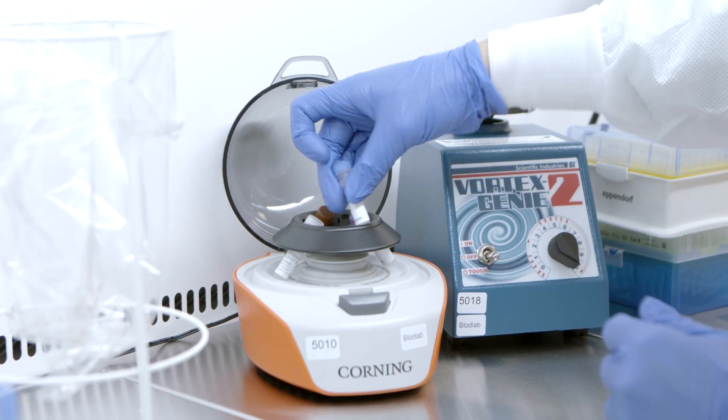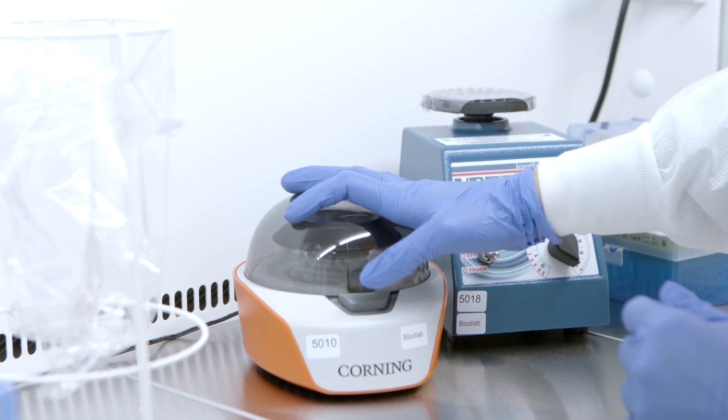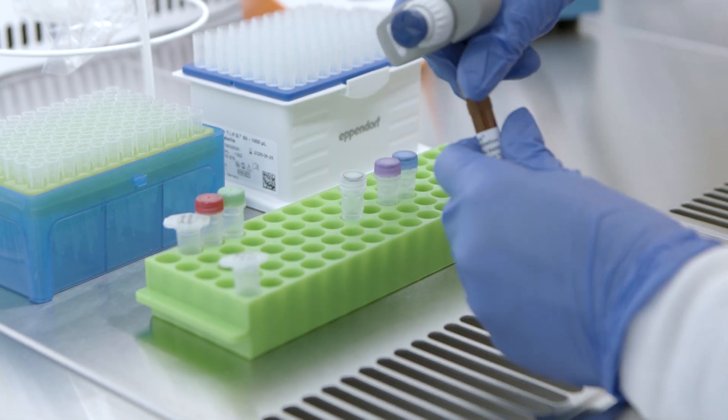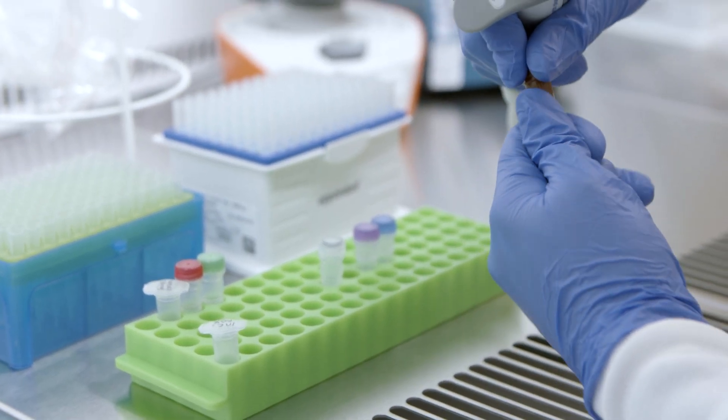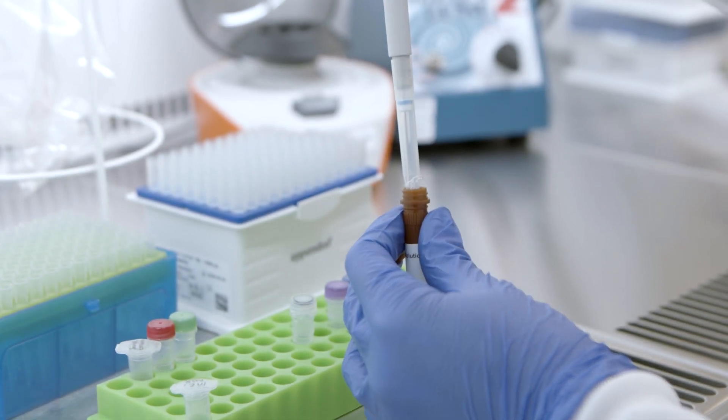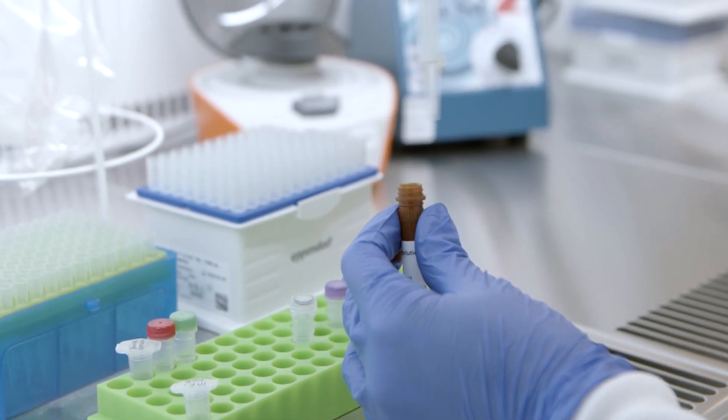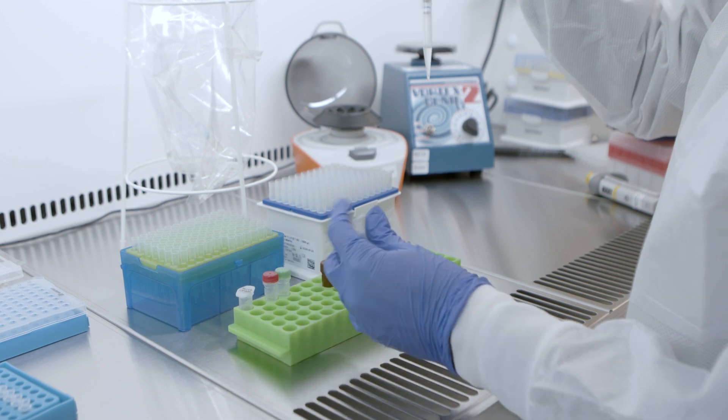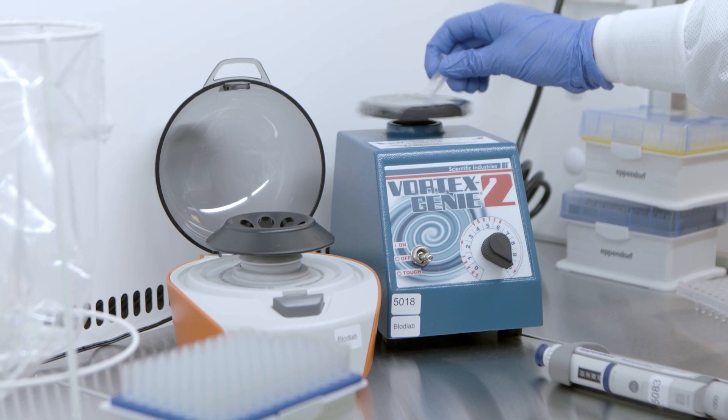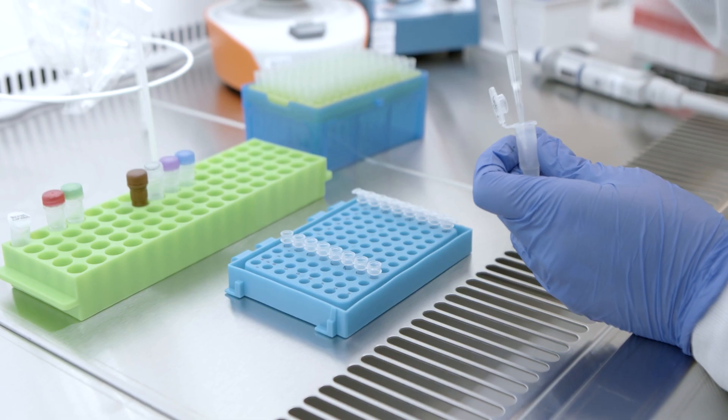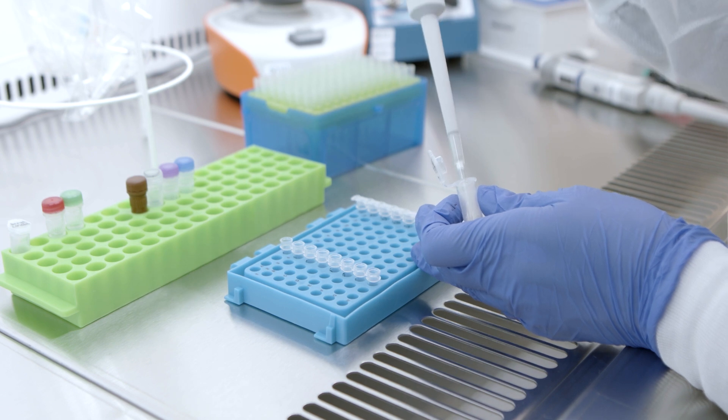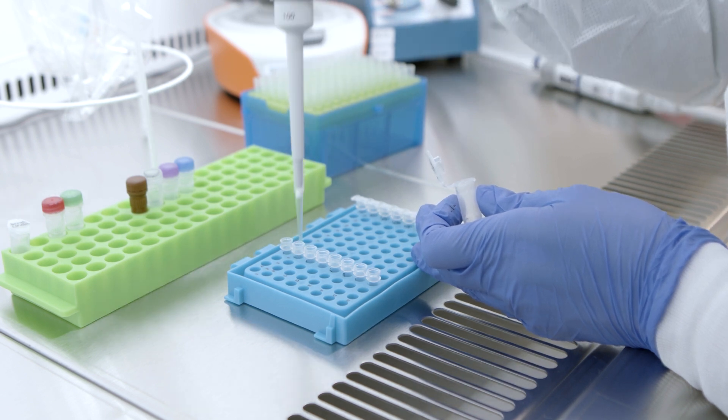Vortex and spin down all reagents before making the incubation mix. Prepare the incubation mix by combining the incubation solution, incubation stabilizer, and A and B probes in a microcentrifuge tube, according to the volumes mentioned in the O-Link user manual. Vortex and spin down the incubation mix. And transfer 47 microliters into each well of a new 8-well PCR strip labeled as incubation mix.